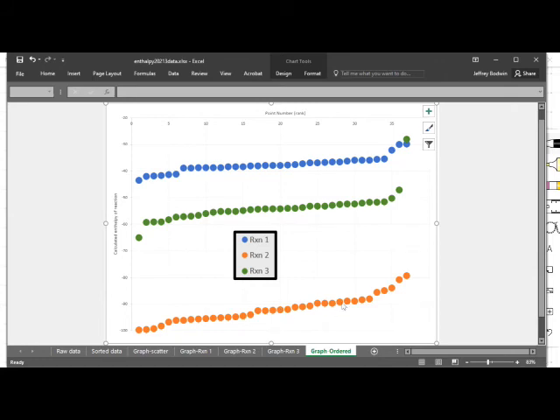And again, looking down at reaction two, that's pretty good. You expect these to be sloped. If this was perfect data with zero error, this would be a flat horizontal line. Sorted, it looks like it's got a little bit of a slope to it, but it's not too bad. It seems like it's a pretty smooth data set.